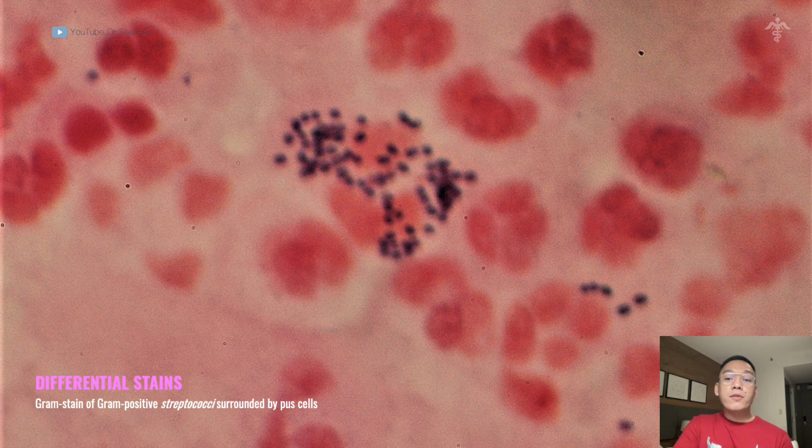Another method is in the form of differential stains. In your general microbiology laboratory, you've also learned the importance and the processes of gram staining of your bacterium and your fungi. This is a photomicrograph of a gram positive. It's pretty obvious in this image that this is gram positive because of the dark purple or dark violet color, your streptococci being surrounded by pus cells.